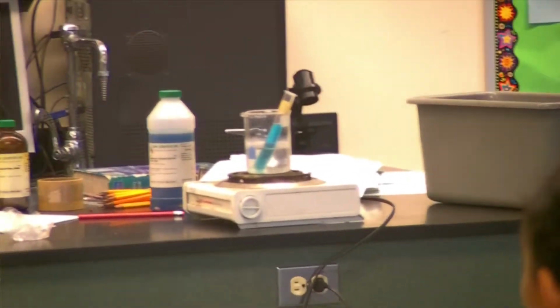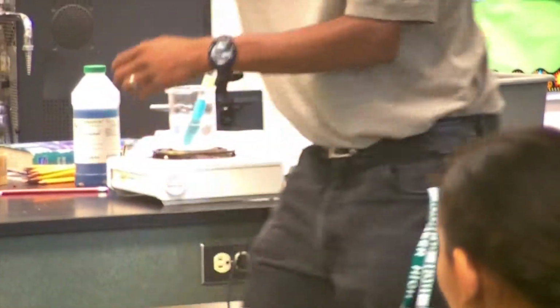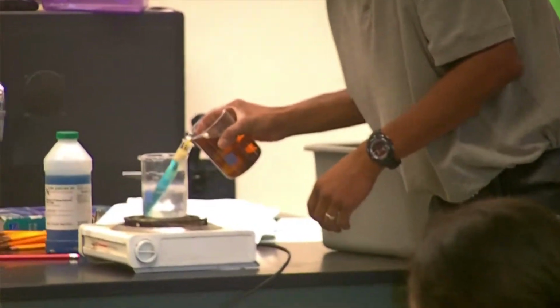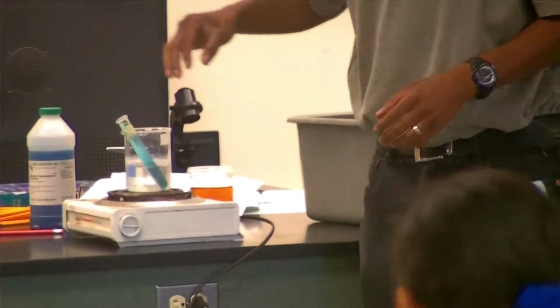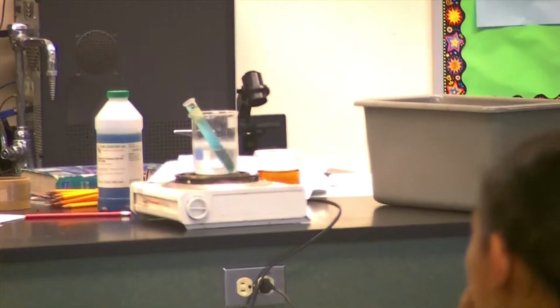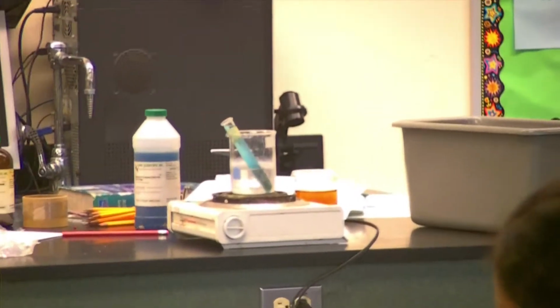Okay? So we're starting here to see something, I hope. Just a little bit. Guess we're trying to put a little bit more of this in there. Don't do this at home. Okay? All right, let that marinate a little bit more. I'm gonna go ahead and speed up the process and let you know that sugar did move out of the bag.